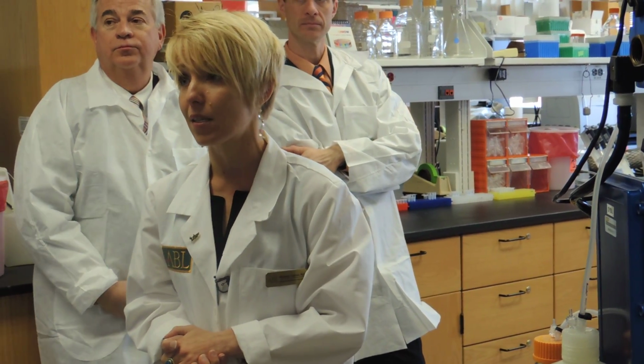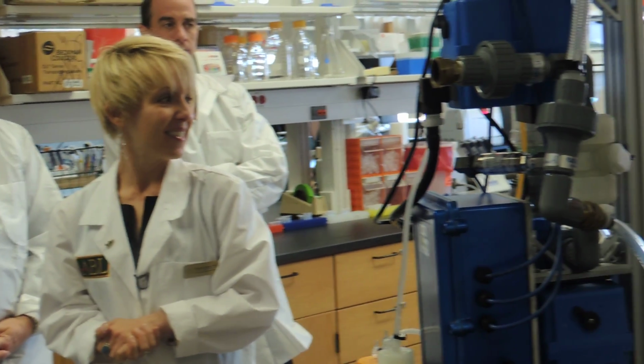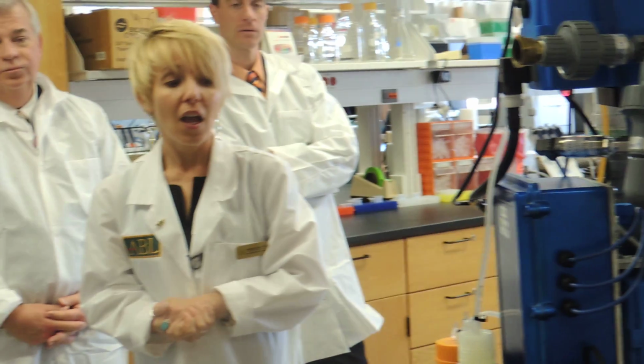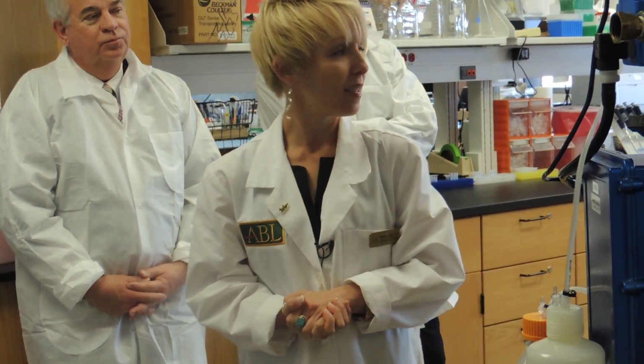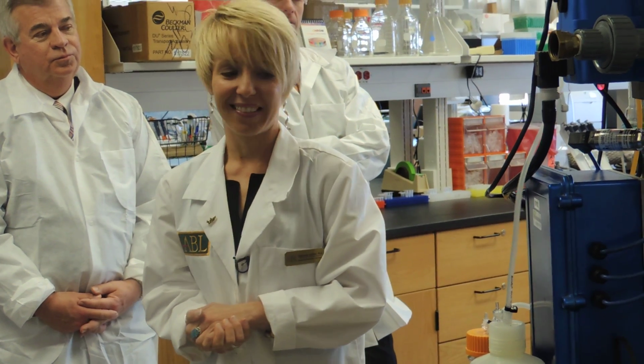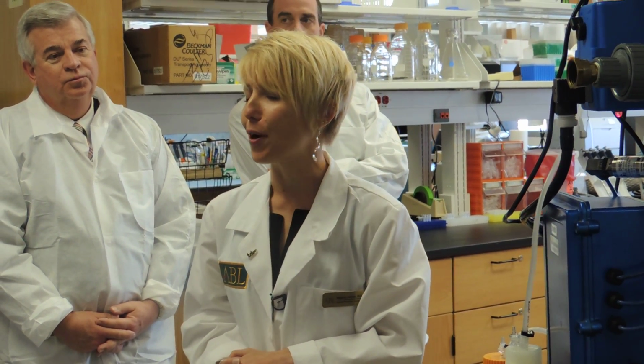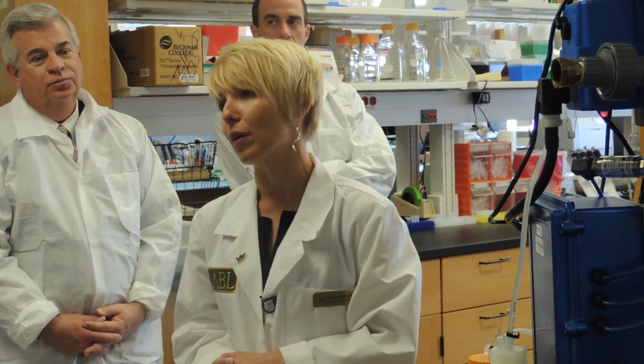So where did that sample actually come from? It was a more turbid sample that had a lot of particulates and stuff. Okay, not from a river or any particular place? It would be most similar to a river. We were testing a new process. Okay, this is the backflush big time. So yeah, that actually is fairly reminiscent of a lot of the waters and rivers from Florida.